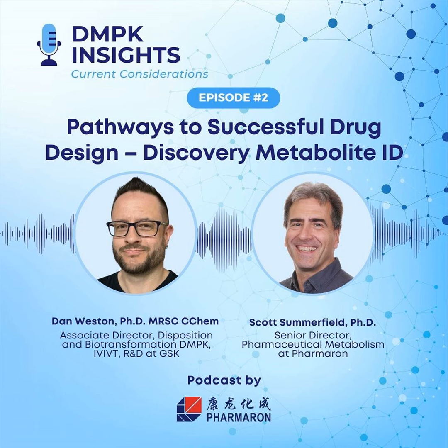We would look to bring in ways of contextualizing those data to make them the most relevant to the project, rather than looking at top X metabolites, let's say. We'd look at flagging a number of things that are important, but not just important based on intensity or caveated relative intensity, let's say.